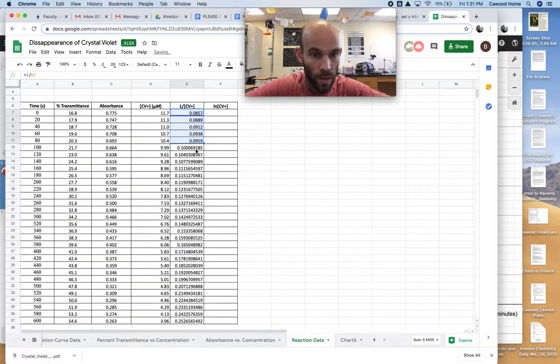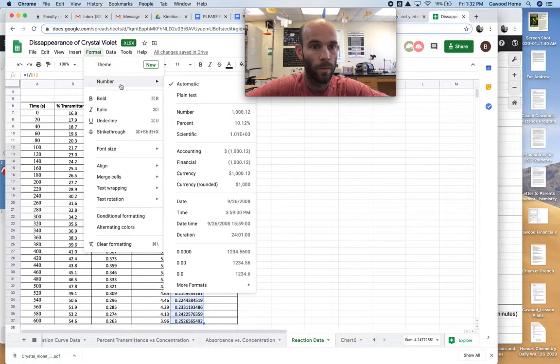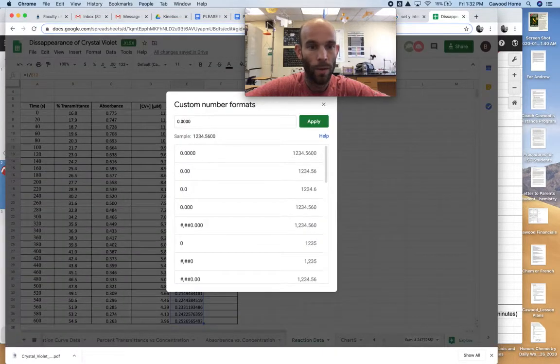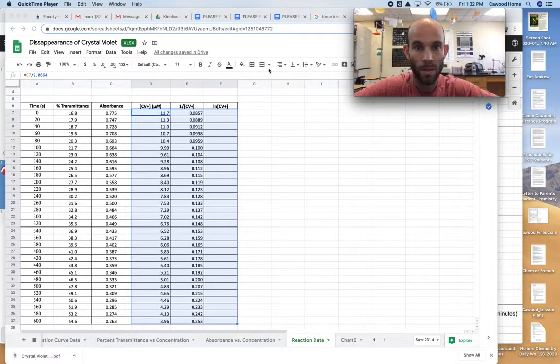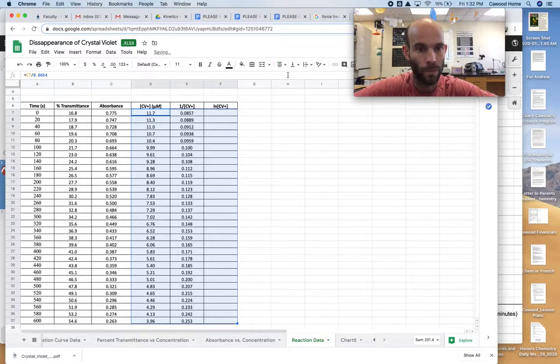And these ones can go to the 1000th place. Plus we can center this stuff up, just to make it look a little bit nicer. Okay, so we've got the reciprocal of concentration.